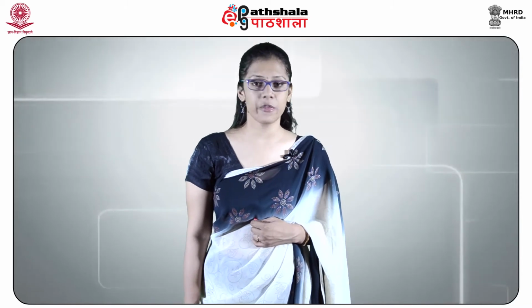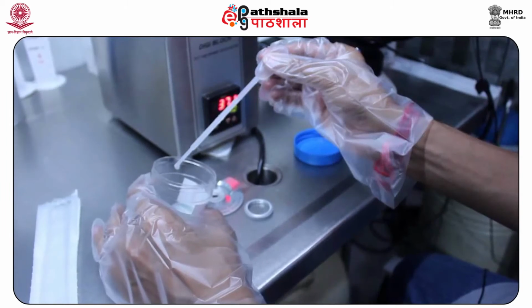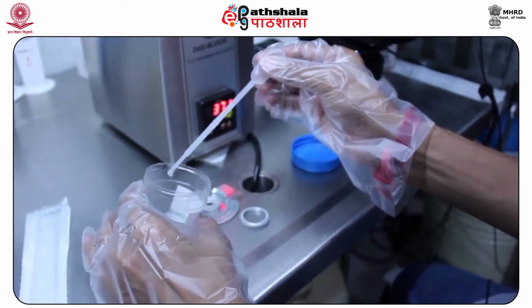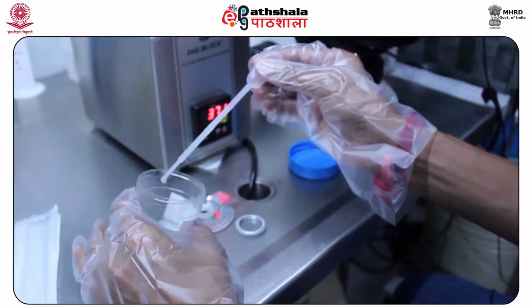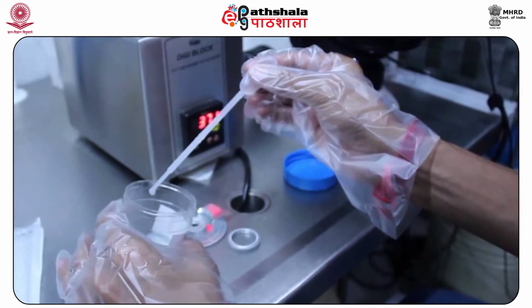Next we move to the presumptive test. First is the acid phosphatase test. The acid phosphatase test is one of the best known and most widely employed techniques for the purpose of identification of semen. The test is adopted because of high acid phosphatase activity of semen.